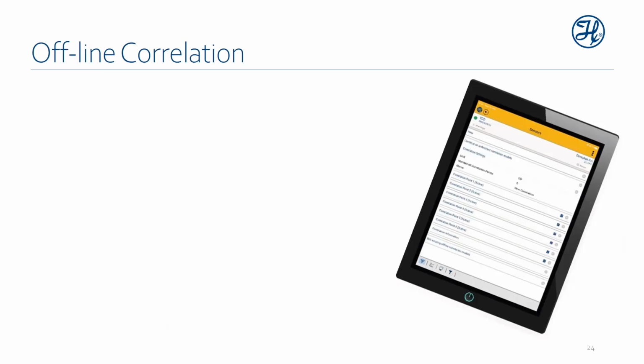Essentially, the sensor will allow you to translate a value that you have in your bioreactor at a given point in time into a signal; it'll correlate against it and output that signal. Why it's important is you need to tell the sensor, at certain points in time throughout the duration of the fermentation, what value it should be expecting, and it's going to use a combination of the transmission and reflection values it sees in order to get a single output.